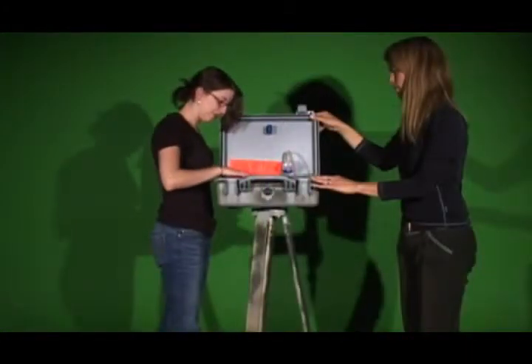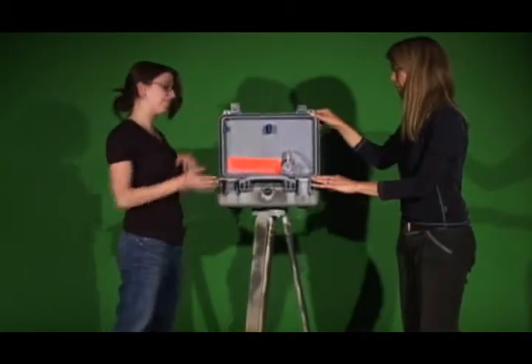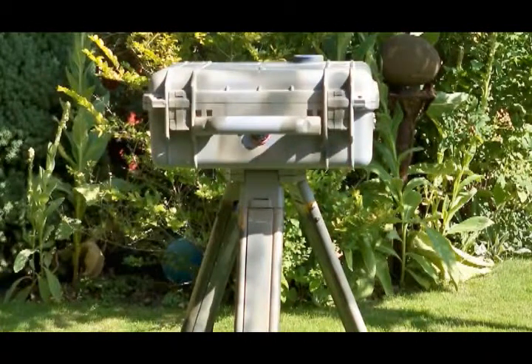Turn the instrument on and engage the program, if you use Track Pro, or manually start it. Close the enclosure completely and make sure the tubing does not get kinked in the process. Your instrument will now run as normal, but can withstand weather.